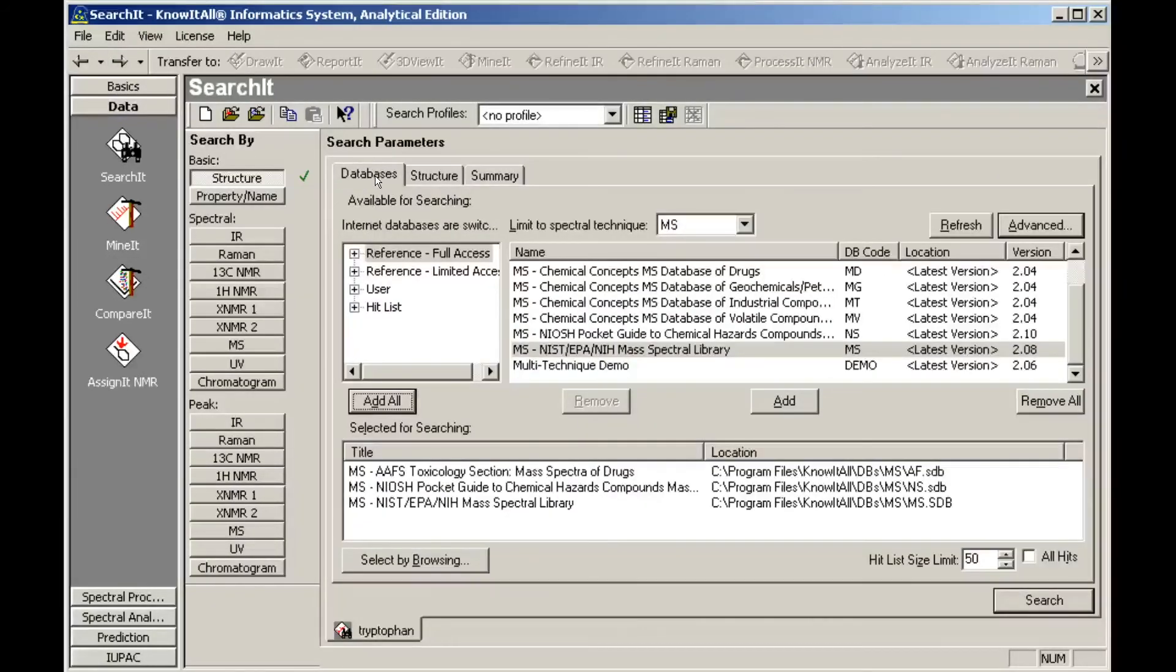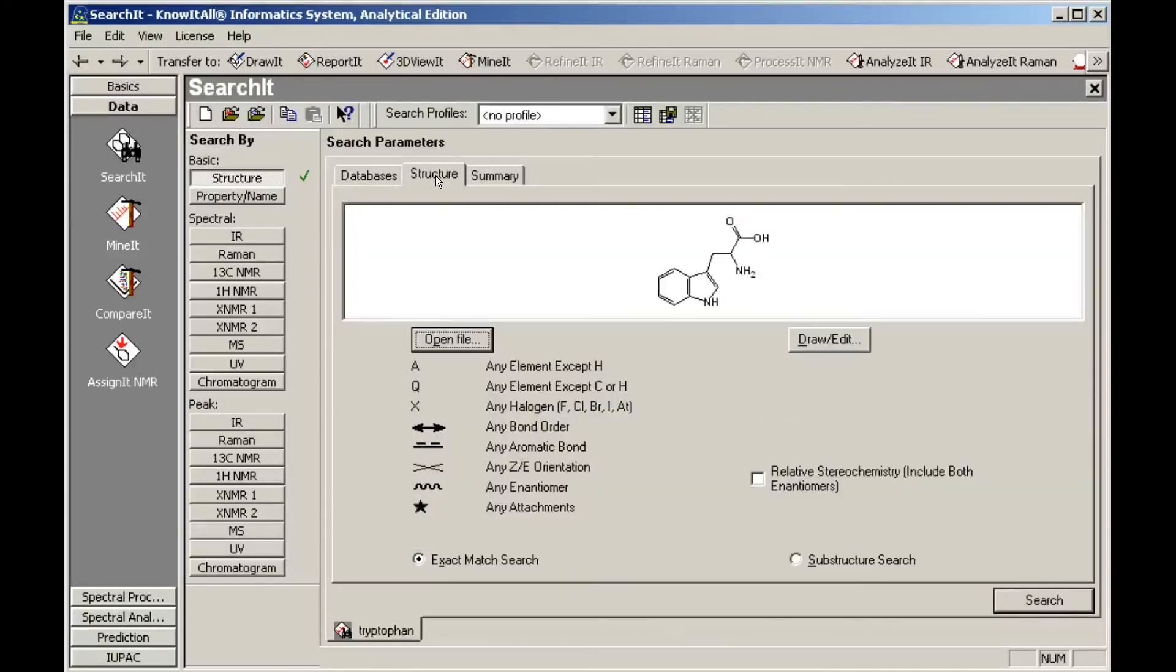The selected databases remain the same, and so do the structure search parameters.